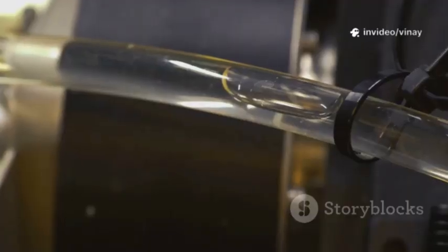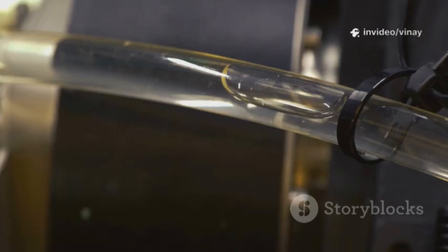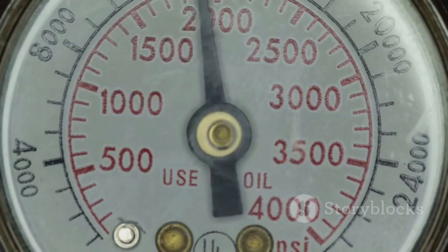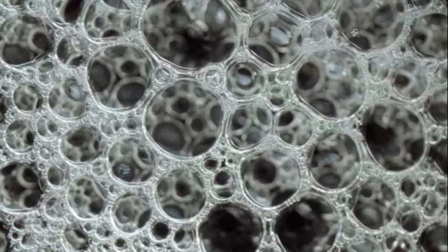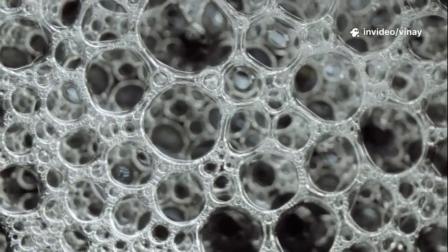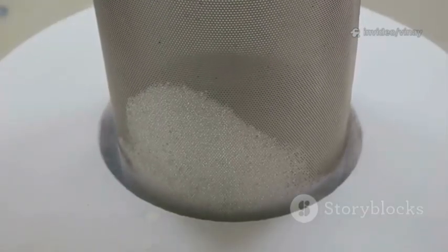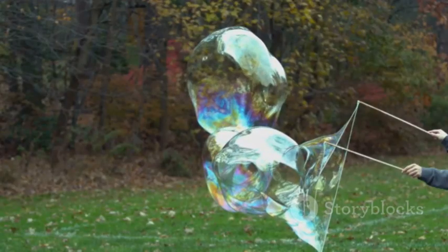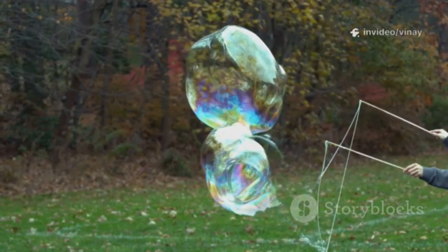At first, nothing happens. The surface tension of the liquid in the pores is strong enough to resist the gentle push of the gas. But as we keep increasing the pressure, we're putting more and more force on that liquid. Eventually, the pressure will become strong enough to overcome the surface tension in the largest pore. Why the largest one? Because it has the weakest grip on the liquid. Think of it like blowing a bubble with a wand. It's easier to make a bubble with a big loop than a tiny one.